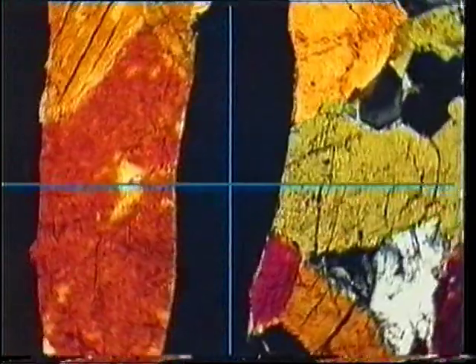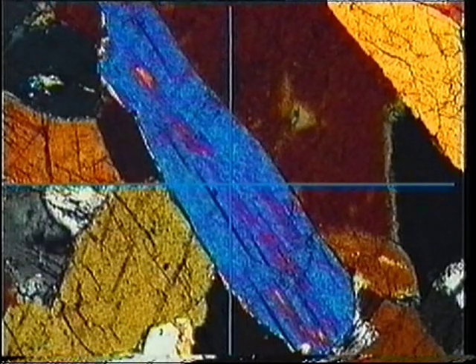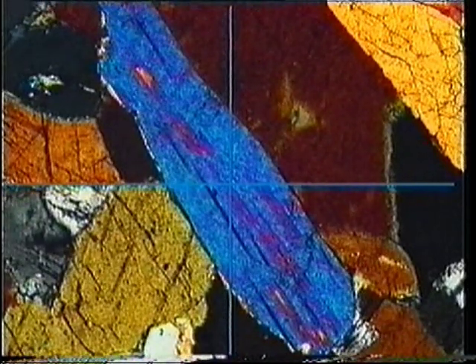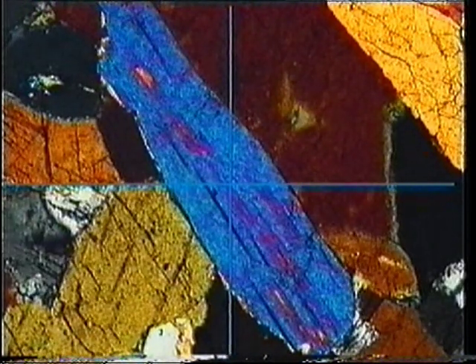Here's another maximum interference colour grain with better prismatic shape. The extinction is inclined, and the extinction angle seems to be about 15 to 20 degrees. We need to measure the extinction angle, Z angle C, and determine where the vibration directions are. First, rotate the C-axis exactly north-south. Note the stage reading.